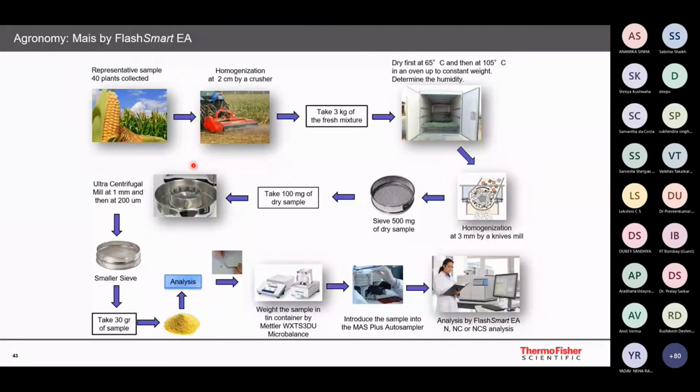Now the same applies to other food samples also. First we dry it, mix it properly, and then use the fine powder for sample analysis. Remember, friends, it is very important that the sample is homogeneous. If your sample is not properly homogeneous, you can't get proper results. Again, moisture will be there. You can note beforehand that the substance or material is hygroscopic.